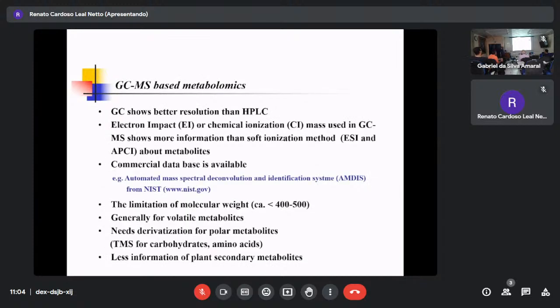And among those, actually, metabolomics started with GC-MS. It comes around like that. Then GC-MS, GC shows better resolution than HPLC. Do you agree? Because the peak is sharp. Why is it better? You know, HPLC is a little bit broad, but GC is very sharp. Have you ever thought about this one? What? The length of the capillary column. So why can't we use a capillary column with HPLC? Some years ago, we used the capillary column. And even capillary NMR is also possible.